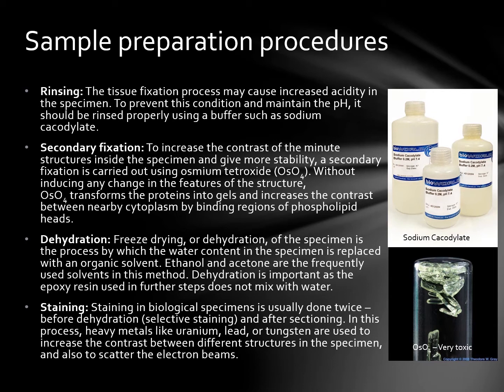So following fixation, there are a few important steps that need to be conducted. Rinsing is very important because the tissue fixation process may cause increased acidity in the specimen. To prevent this condition and maintain the pH, it should be rinsed properly, using a buffer such as sodium cacodylate.